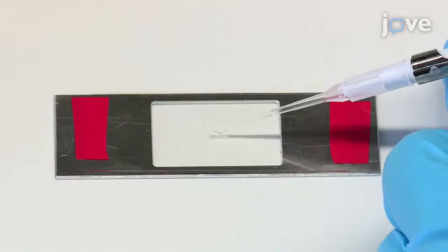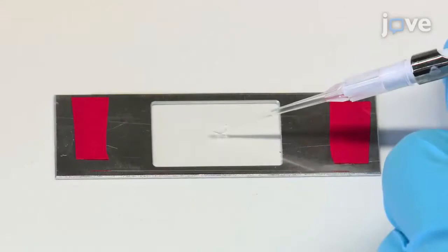Add 10 to 20 microliters of exponentially grown M. xanthus cells onto the cover slip.